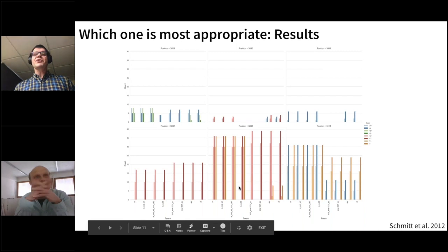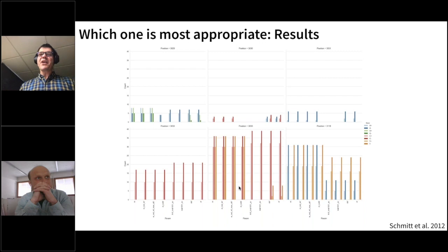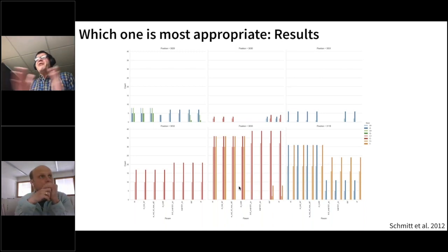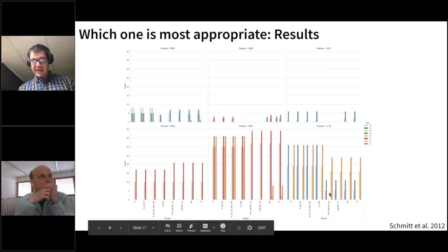Okay. So mutect2 actually behaves comparatively well. However, the problem with mutect2 is that it doesn't know how to deal with multi-allelic sites. So it simply computes the frequency based on the top allele. So if you have C and T, and C has a frequency of, say, 10%, and T has a frequency of 5%, it will report as though both of them have a frequency of 10%. And you can see it here, for example. In this case, lowfreq differentiates between blue and orange, but for mutect, they're the same height.